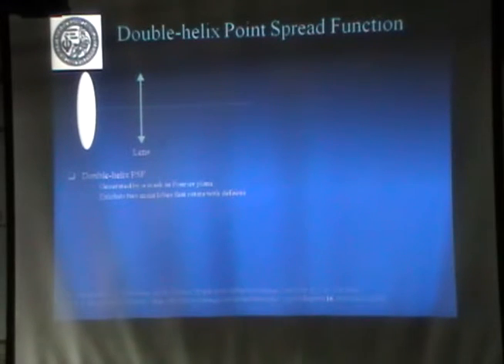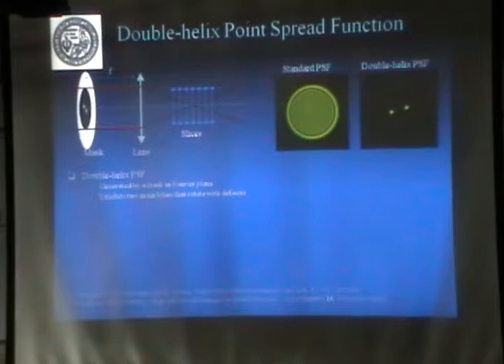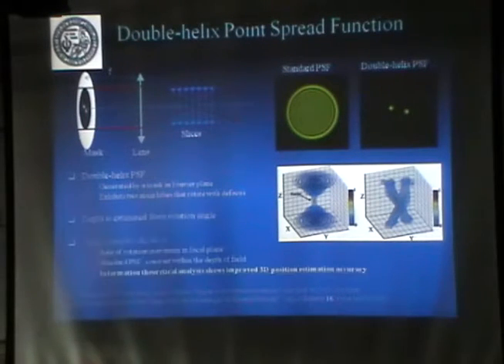Now with self-generating beams, we are going to take that hologram that generates that beam. And okay, so this is the aperture, the lens, and looking at different planes. Without anything here, you see the defocus. So now I'm going to put here the hologram, and what I'm going to see is this rotation. Now I'm moving the screen, as I was saying. So this is 3D, the same thing. So this is better to find the location of things in Z, and essentially gives you this quote-unquote axial super-resolution.